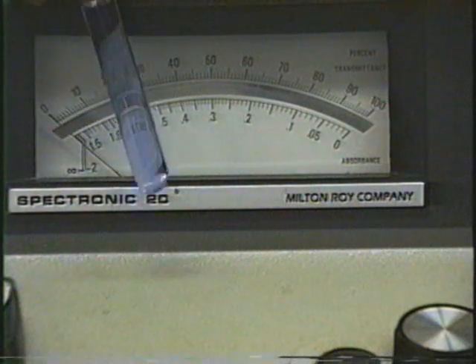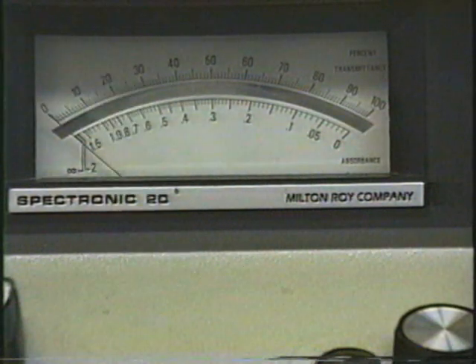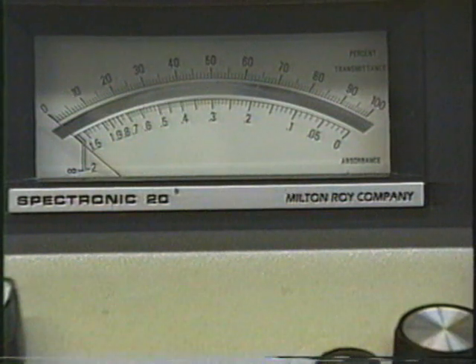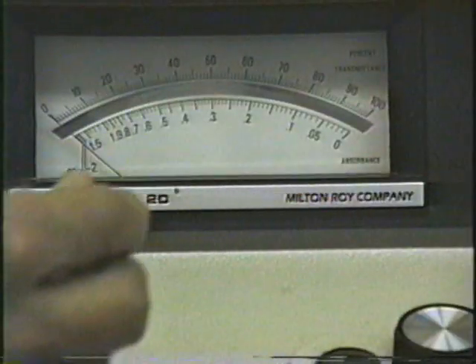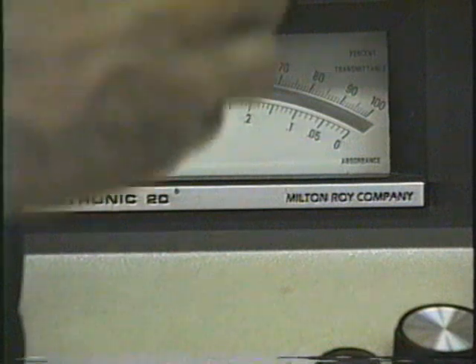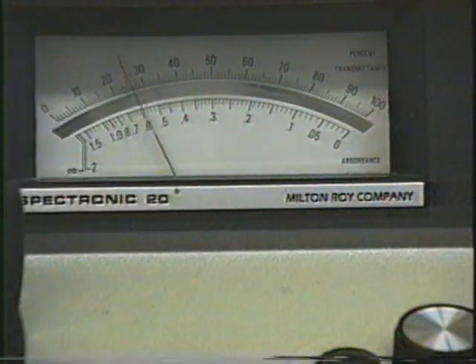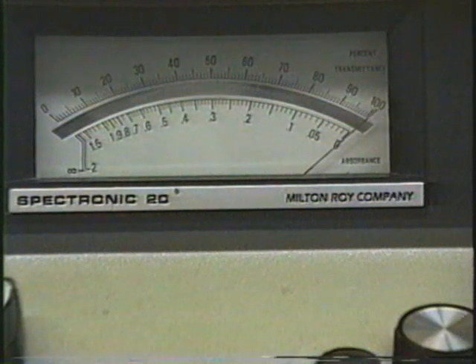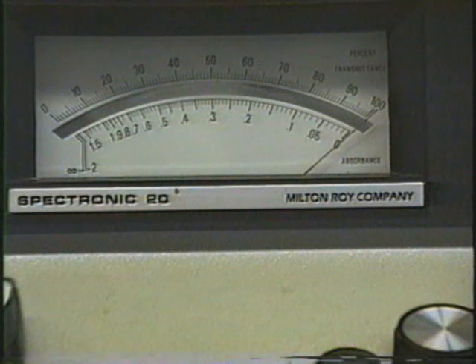Okay, we have another solution here. This is B, say our standard or something of that sort. Now what we're going to do is just go through everything that we have done. We make sure that it's reading 0 with nothing in it. Now we're going to put the machine's reference in. Again, I'll clean it off so I don't have fingerprints in case somebody accidentally handled it improperly. Always line up the trademark with the mark on the sample holder there and adjust this exactly to 100.